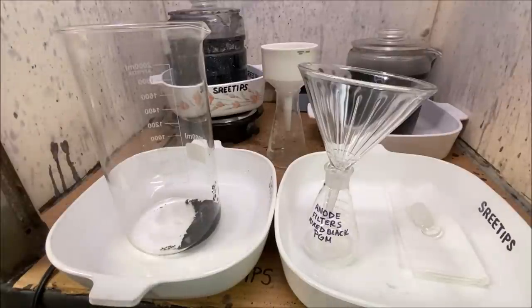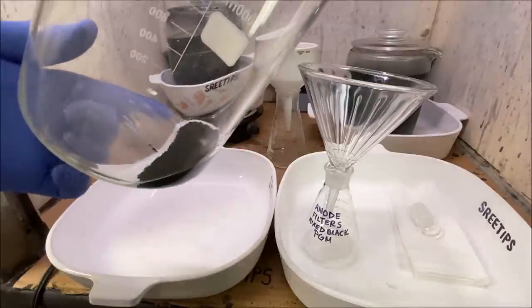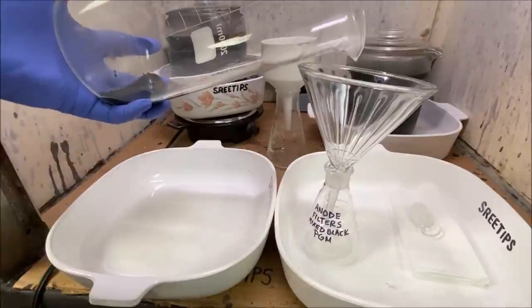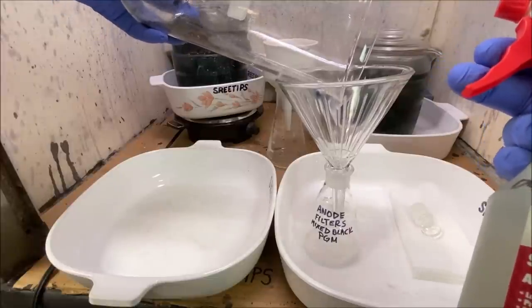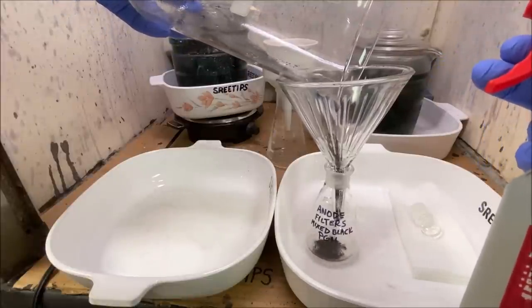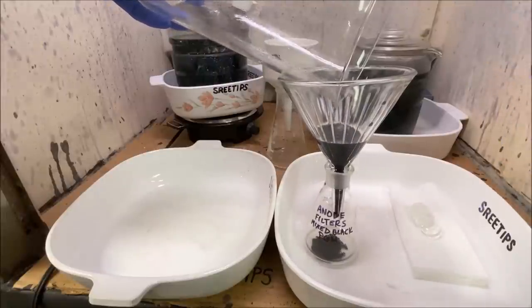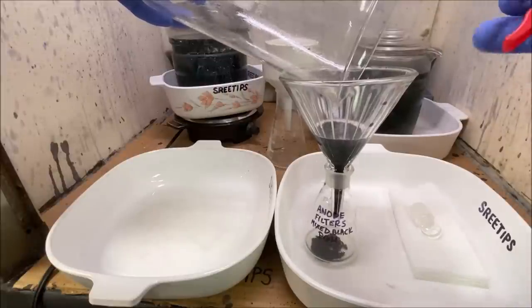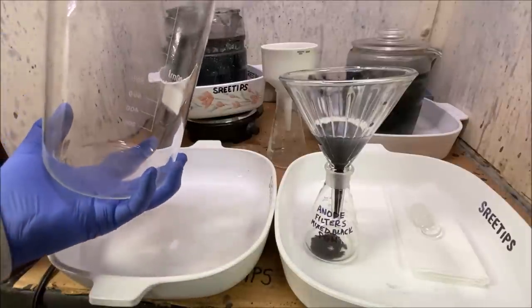Welcome back to the 8th and final episode of the Anode Filters Recovery Video. Here is our mixed black PGMs at the bottom of the speaker. Unfortunately it's going to be a little bit of a disappointment here — I had to make a judgment call. The amount of material here is just not going to be enough to justify a full refining, so I'm going to get it down into this container and save it for a future video.